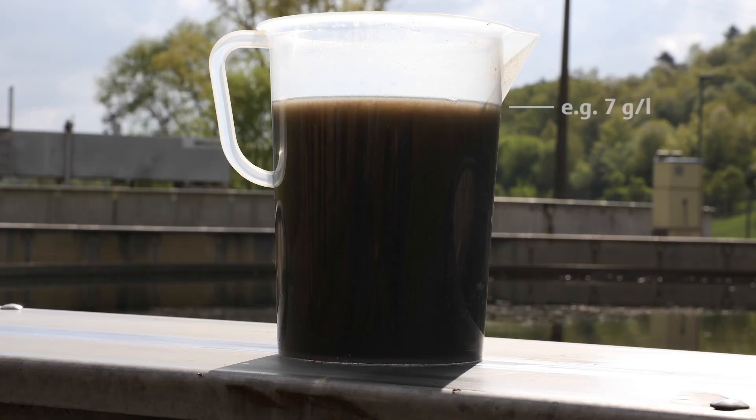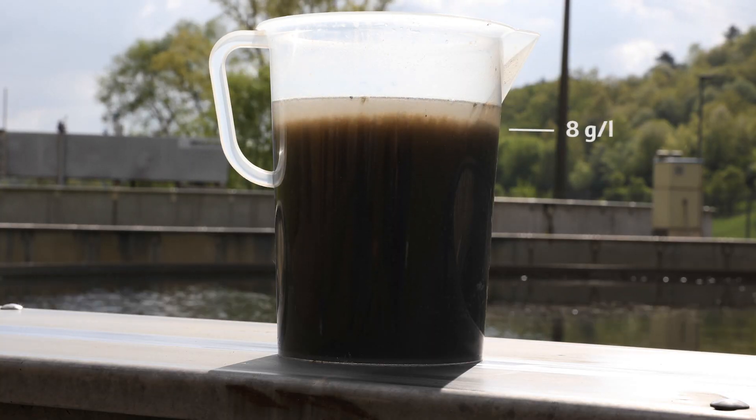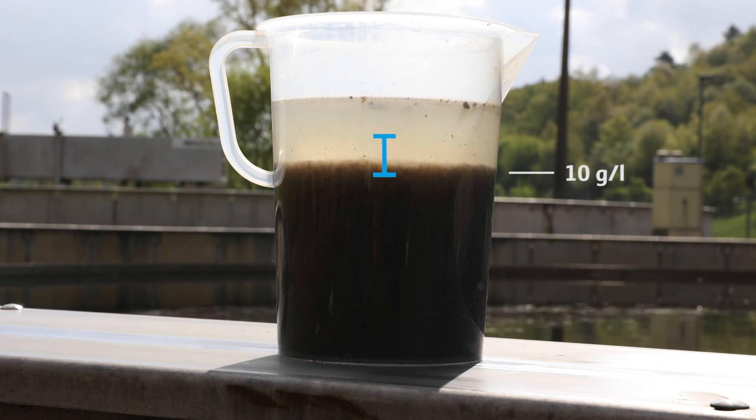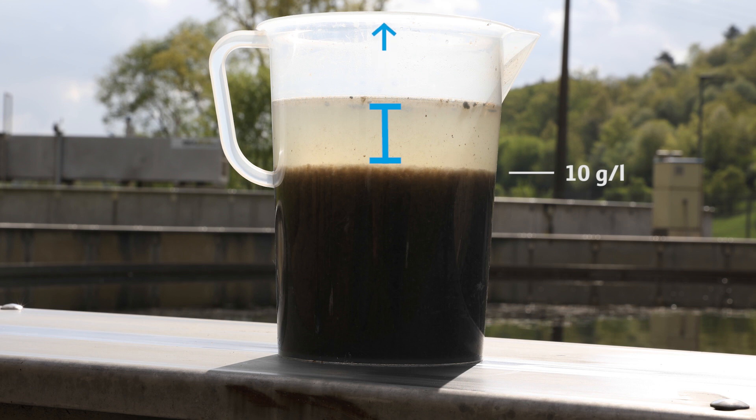The concentration of the original sample should be as close as possible to the upper measuring range. If this is not the case, as in our example here, we have to increase the concentration of it. Therefore, we prepare the sample as follows: we take a sample of about 10 liters and wait until the particles settle down. Then we remove unnecessary water to get a higher concentrated sample. Now, with this concentrated sample, we can prepare our serial dilution.